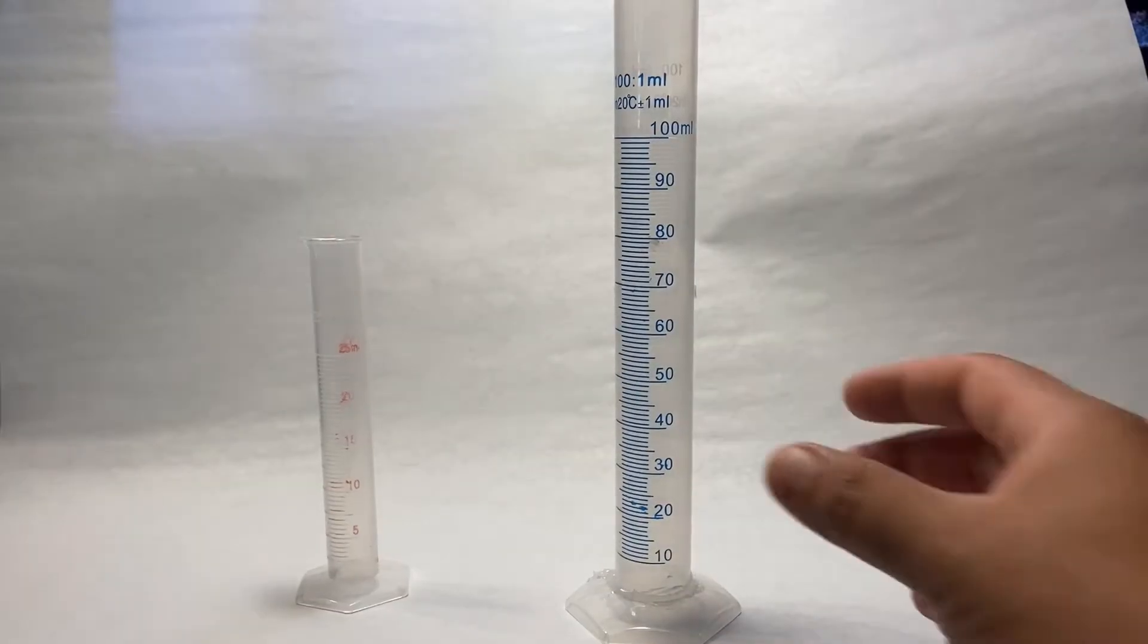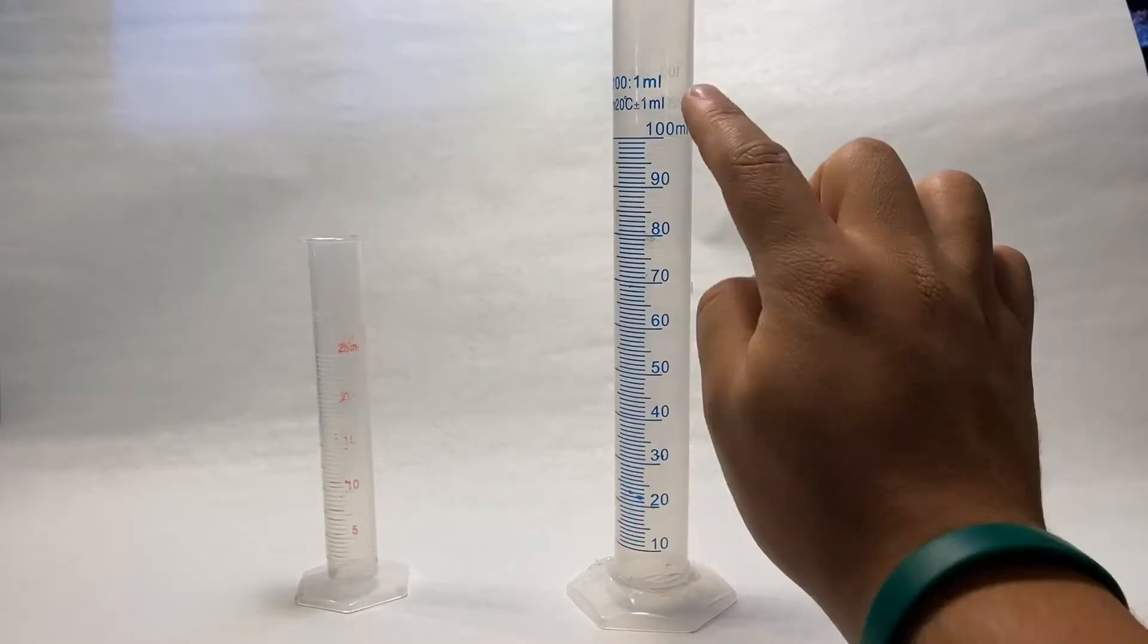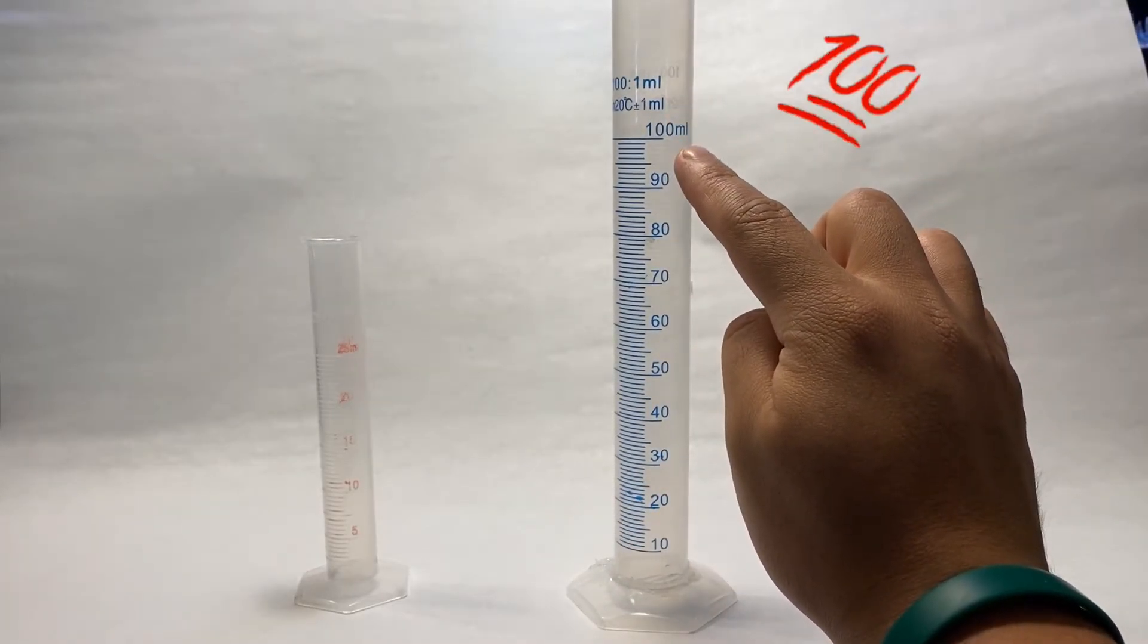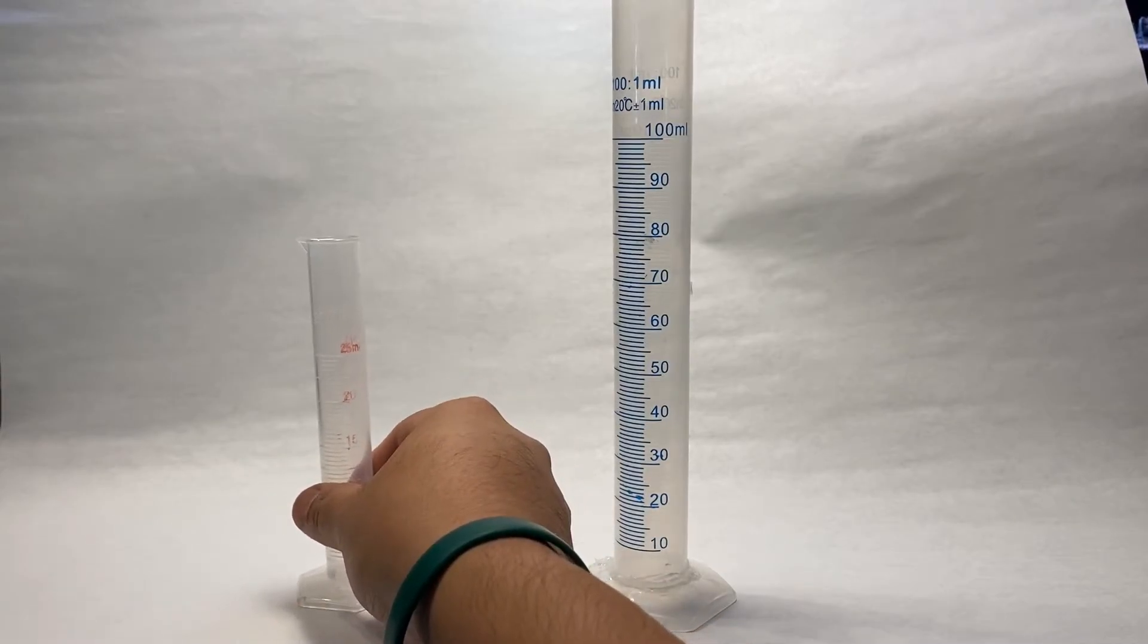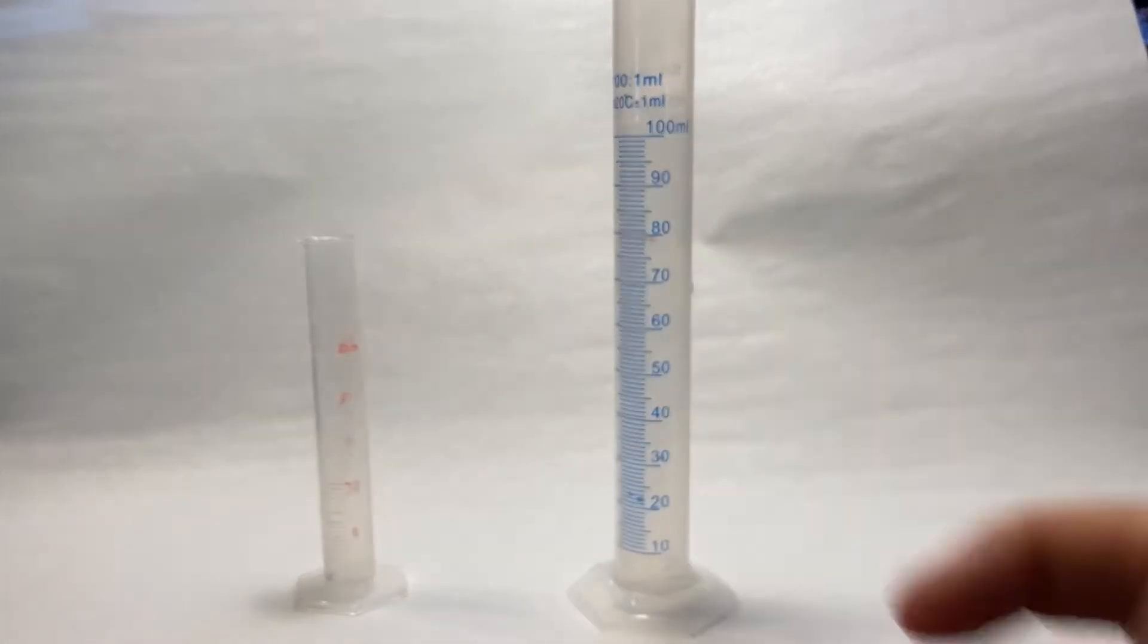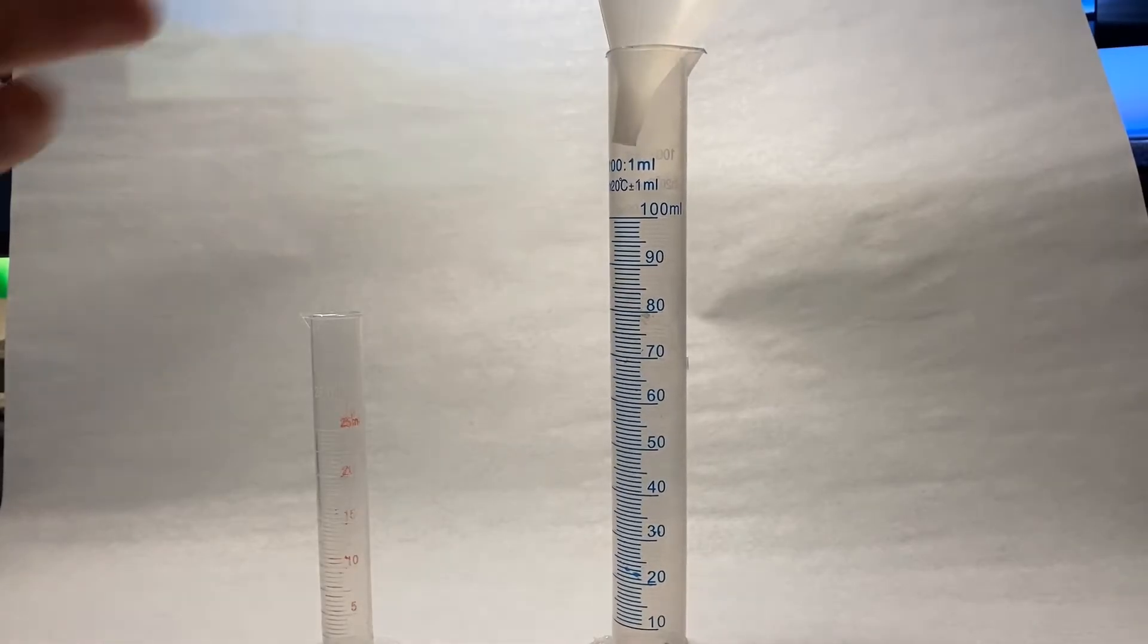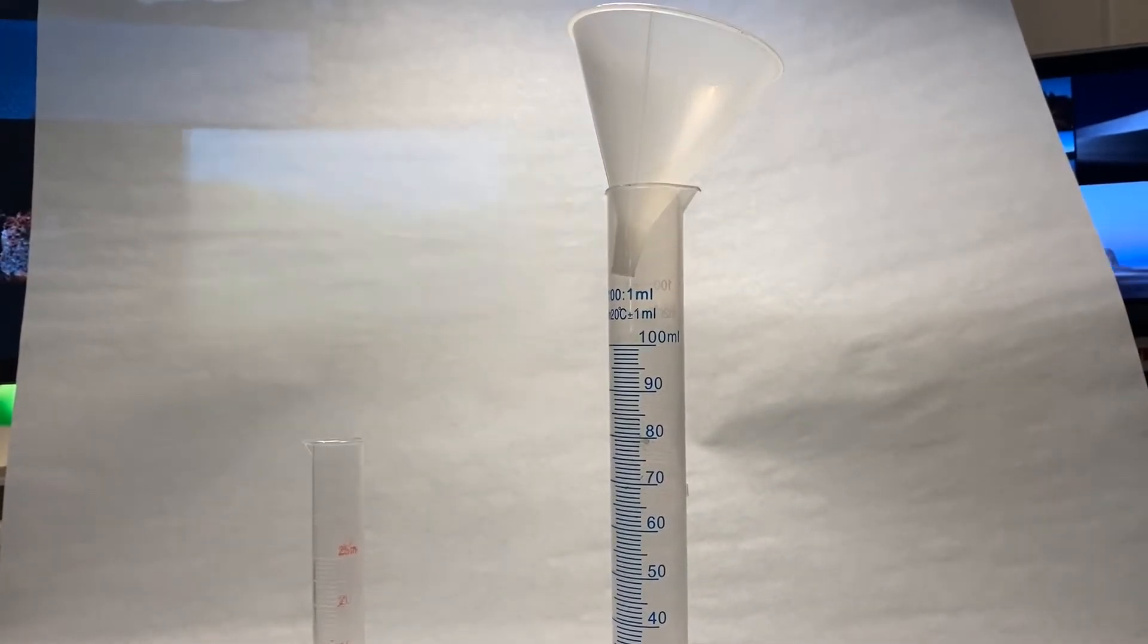All right, so stay tuned, hopefully you guys enjoy and let's roll it. Here we have a graduated cylinder. This one goes up to 100 milliliters, this one is going to be kind of hard to see, only goes up to 25 milliliters. Now what I'm going to do, I'm going to take my funnel, put my funnel up there and I'm going to add some water.